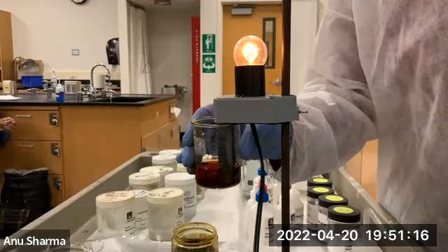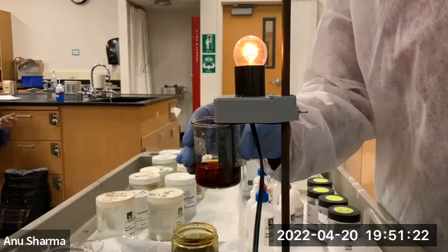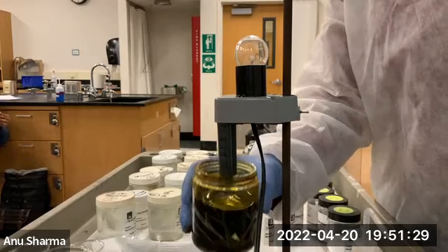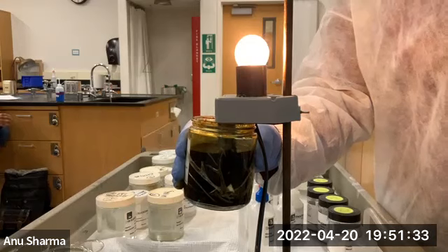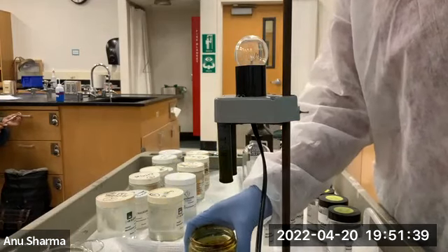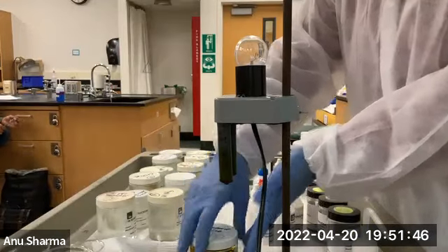So it is HI acid, and HI acid will give you hydrogen ions and iodide ions. That's why it's conducting electricity. So this was in water. I just want to see the tincture of iodine. Oh, the tincture of iodine is even brighter. You see that? So tincture of iodine contains lots of iodide ions.